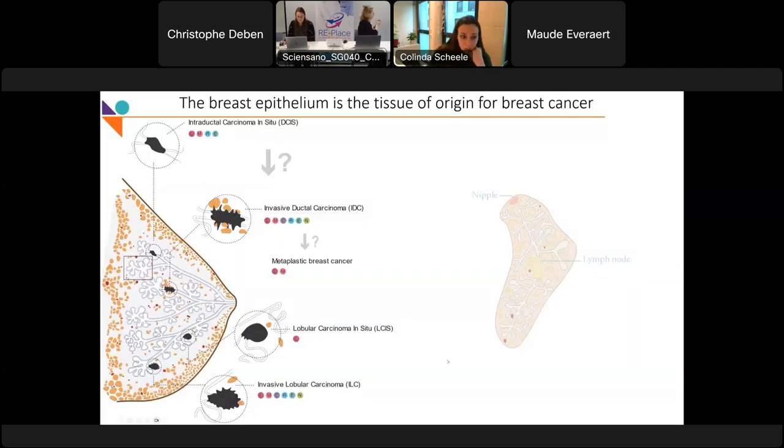For the next part, I will go into organoids that we established with mouse tissue as donor tissue, because there we are already much further with the development. And I also want to show you how we can use these tissues to establish organoids that you can passage multiple times, again also reducing the number of animals that we use in our research.